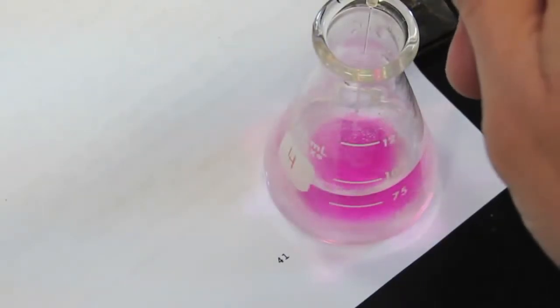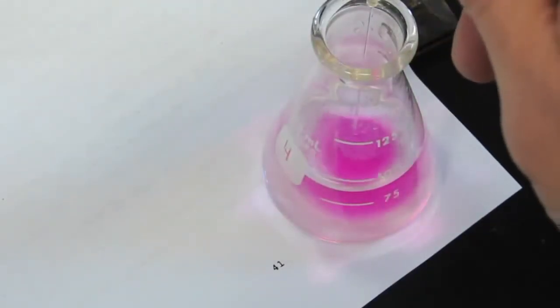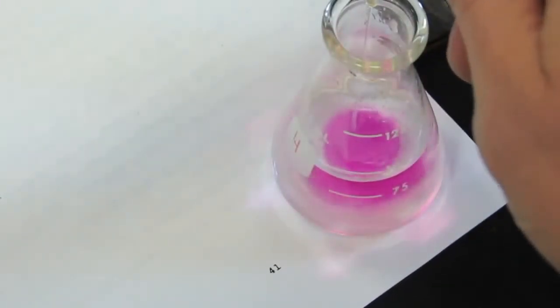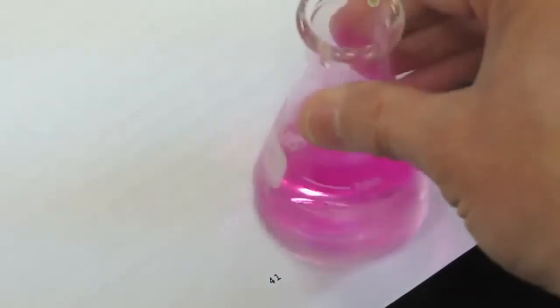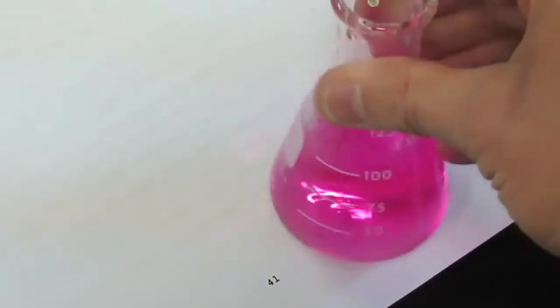Getting fairly close to my endpoint. The endpoint is when the color changes there, and it stays at least for 30 seconds after swirling. So getting closer. You can see this is pretty easy to do and actually sort of fun. So it's staying a bit longer. I'm getting very close to my endpoint, and there we go.